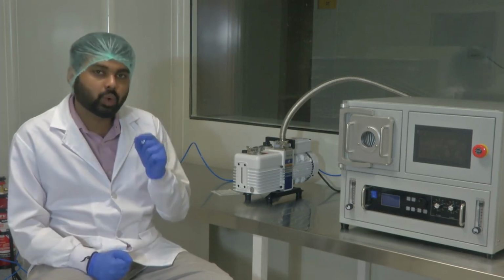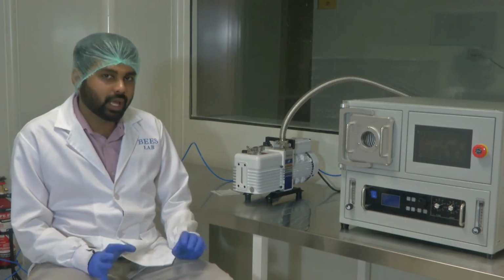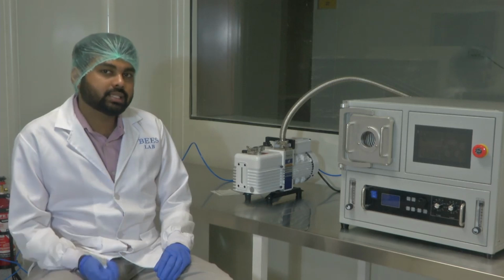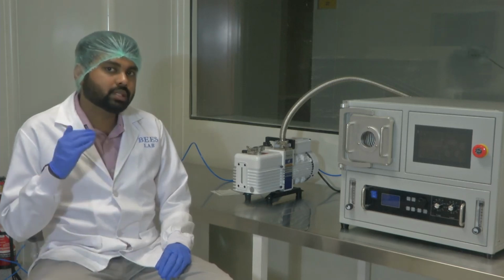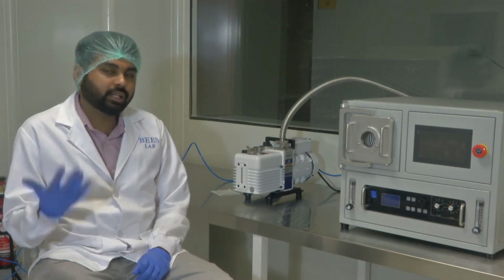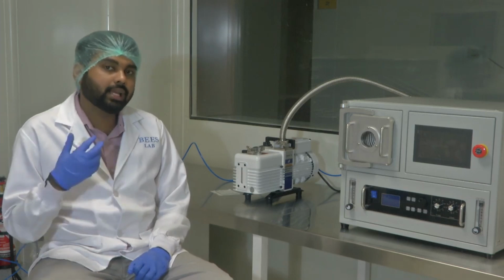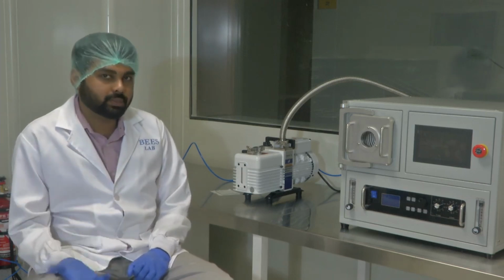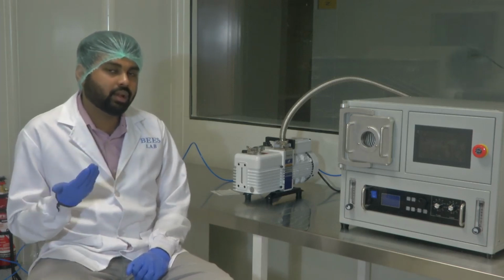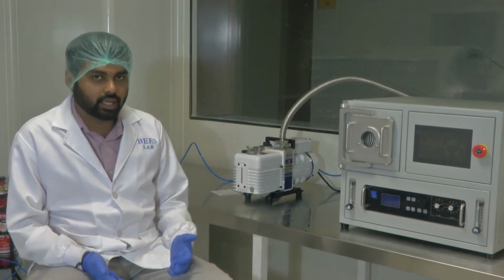Then we slowly increase the RF power, and at one point it becomes plasma, and you will start seeing a glow. After that, when you increase the power, the glow becomes brighter and brighter. That shows the energy that is getting stored in the plasma, and the etching power or the cleaning power of the plasma. Here, one thing to notice, you cannot indefinitely increase your RF power, because there is always a tripping point on any device. It will just get tripped.